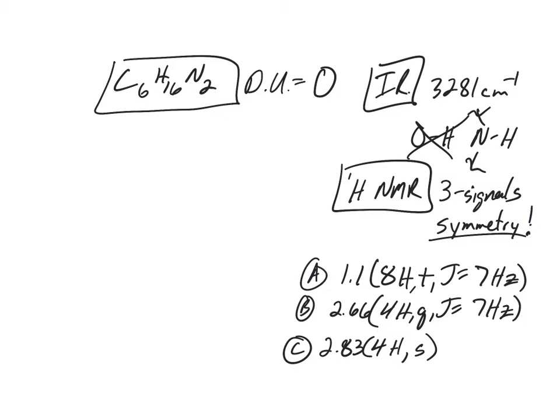The way I'm thinking about this, hydrogen comes on carbon in how many different ways? It comes on as a CH3, a CH2, or a CH. Do any of those add up to 7 to make it symmetrical? No. Usually you have 2 CH3s that are exactly the same, so you have 6 hydrogens that are the same. You could have 2 CH2s that are the same, and then we'd have 4 that are the same. So in this case, thinking about symmetry, how many NHs do you think there really are? There's 2 NHs.